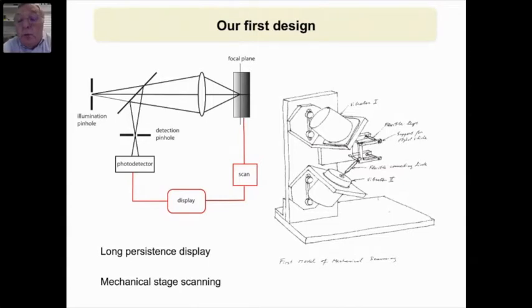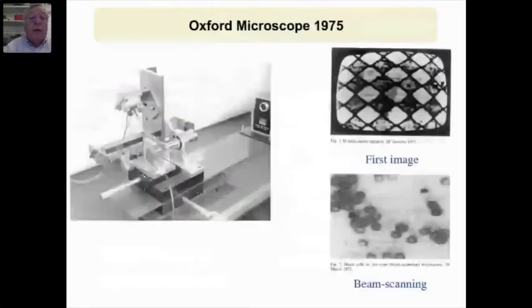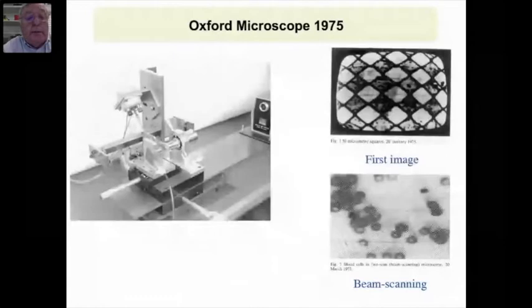It had 2 vibrator-type voice coils scanning a support mechanism with flexible legs, as I show there. This didn't last more than a few days because the flexible legs broke fairly immediately and was replaced with a stretched piano wire system that I show in the image here.